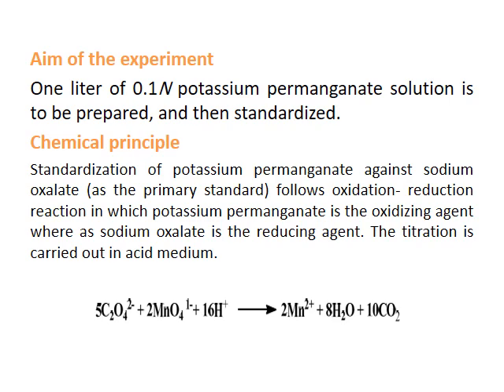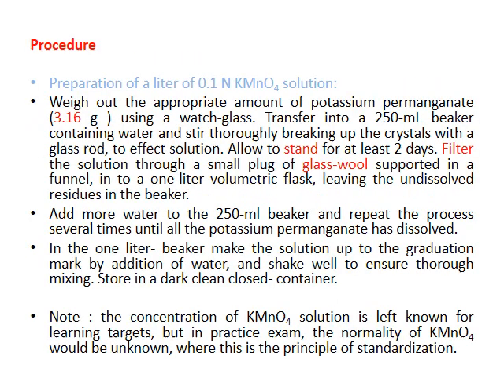The aim of the present experiment is preparation and standardization of potassium permanganate solution. The procedure of this experiment includes preparation of 0.1 normal KMnO4 solution and preparation of 0.1 normal sodium oxalate solution, and then conducting a titration between these solutions.